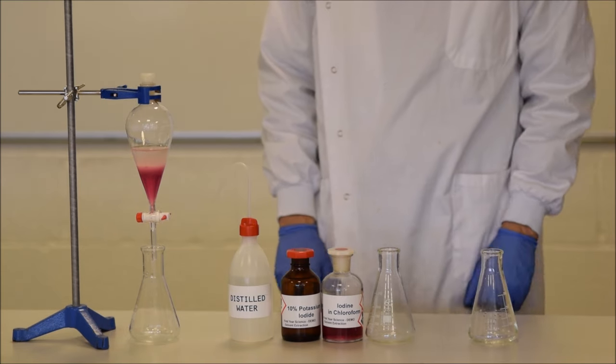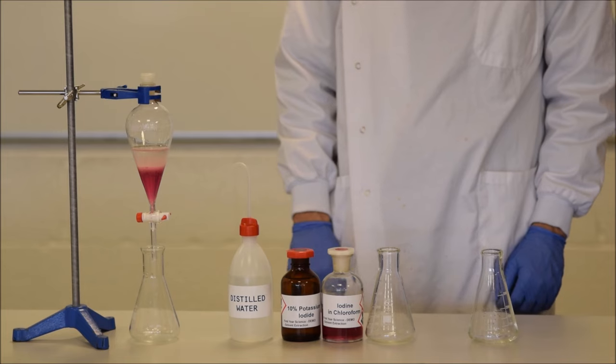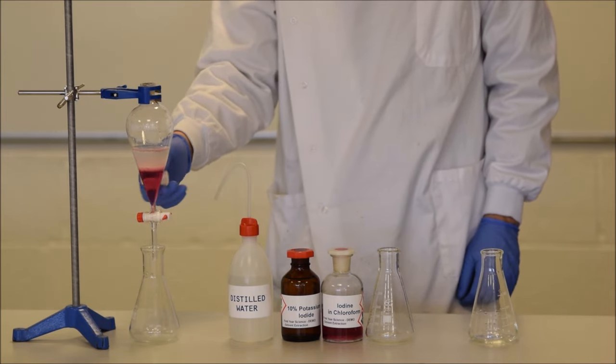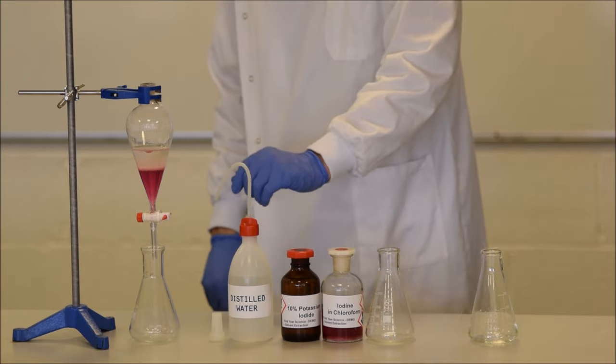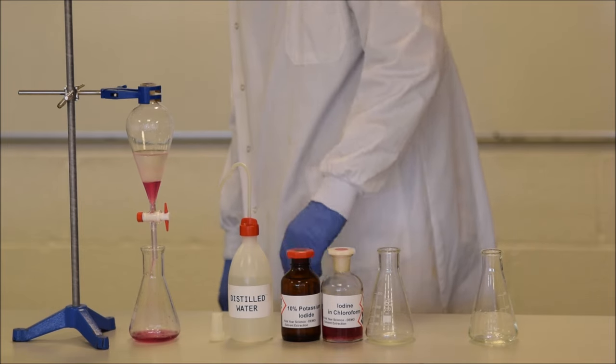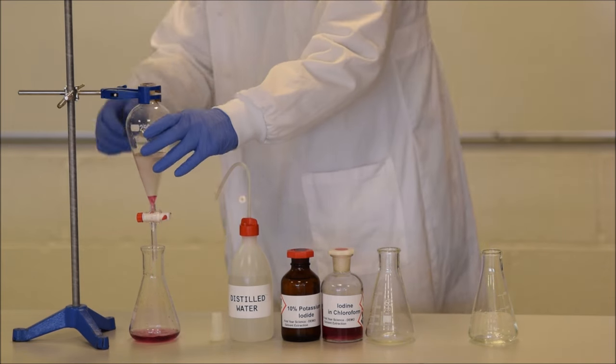After a little while, you'll see that all of the iodine has remained in the chloroform layer, and that's because iodine is not soluble in water. It's a non-polar molecule, and so it has no reason to dissolve. So what do we do? Well, we let the bottom layer out through the tap. Give it a few minutes, I've sped it up a little bit.